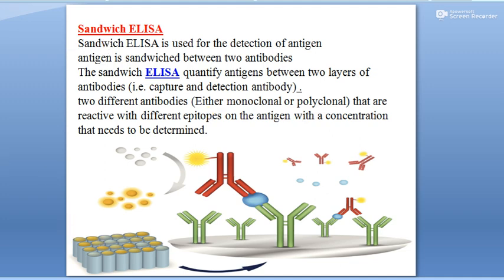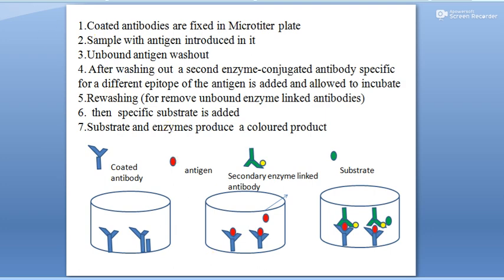So, let us see the steps involved for sandwich ELISA. There is a coated antibody fixed onto the microtiter plate.